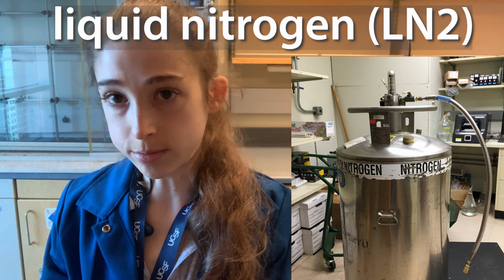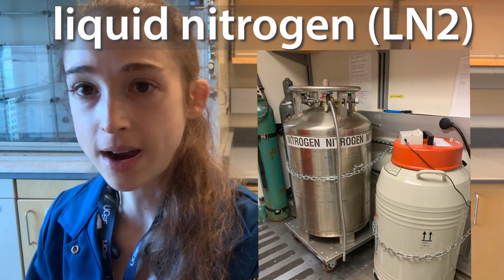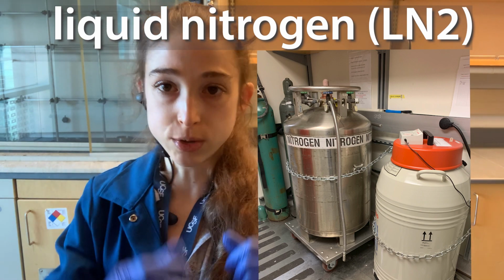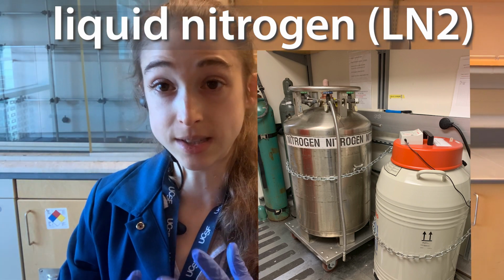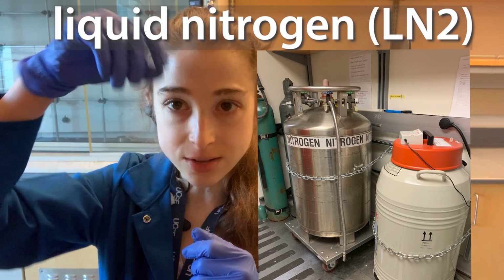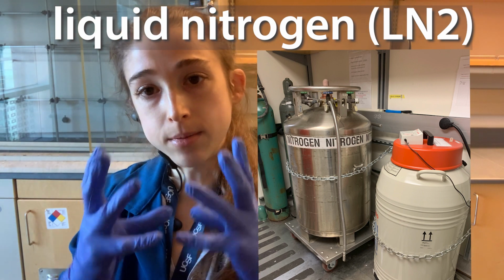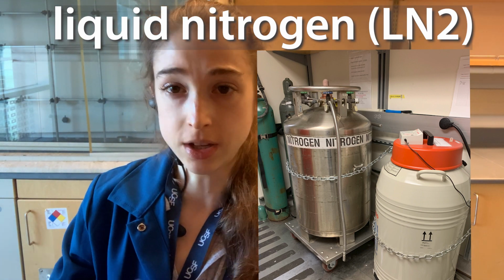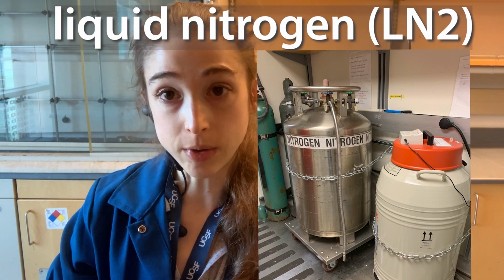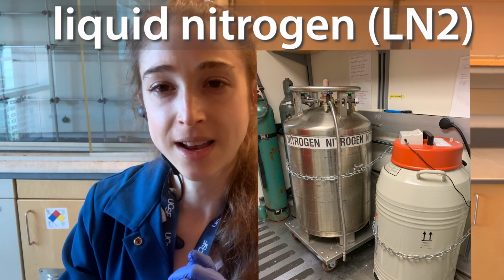Liquid nitrogen is also good for long-term storage. You'll see giant dewars or smaller dewars or transfer dewars, where you can pour out and take a little bit out of the giant tank in order to use. And then we have these giant dewars with racks, and we often use these for storing cell stocks. We have racks with boxes, and each of those boxes has little tubes full of cells. We can also use dewars to ship crystals, like for X-ray crystallography, and various things like that. So liquid nitrogen is another thing we can use to keep things cold, but typically that's more for storage than for incubating things.